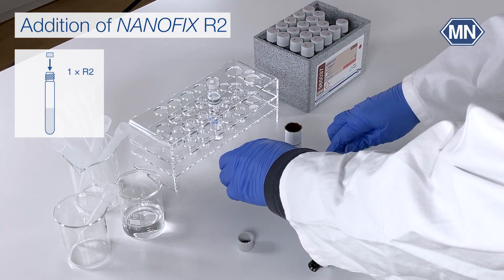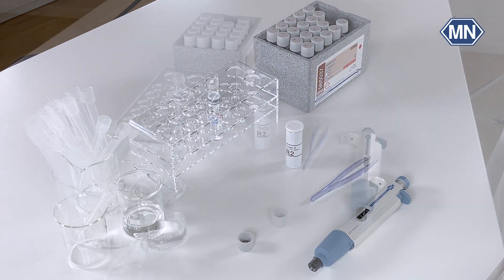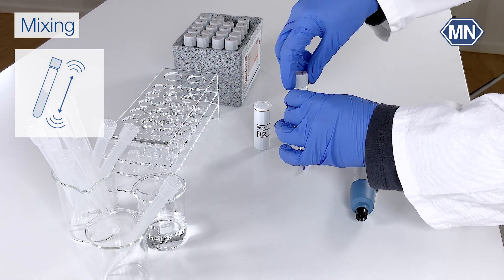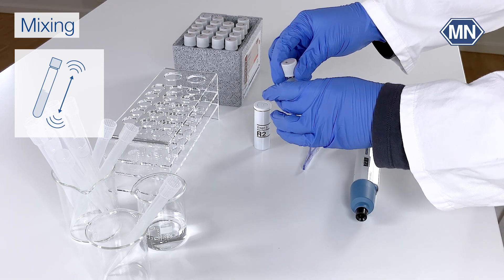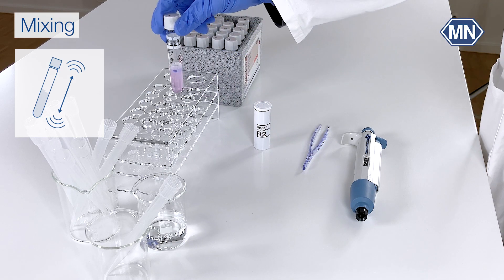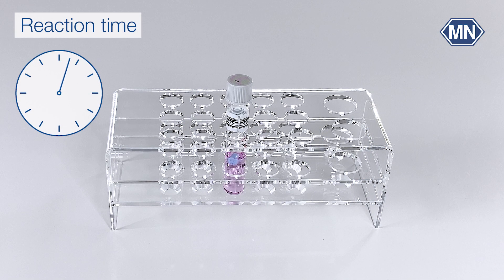Please do not forget that you can use the cap to close the Nanofix reagent again after use. Close the test tube and shake vigorously. The reaction time is 5 minutes.